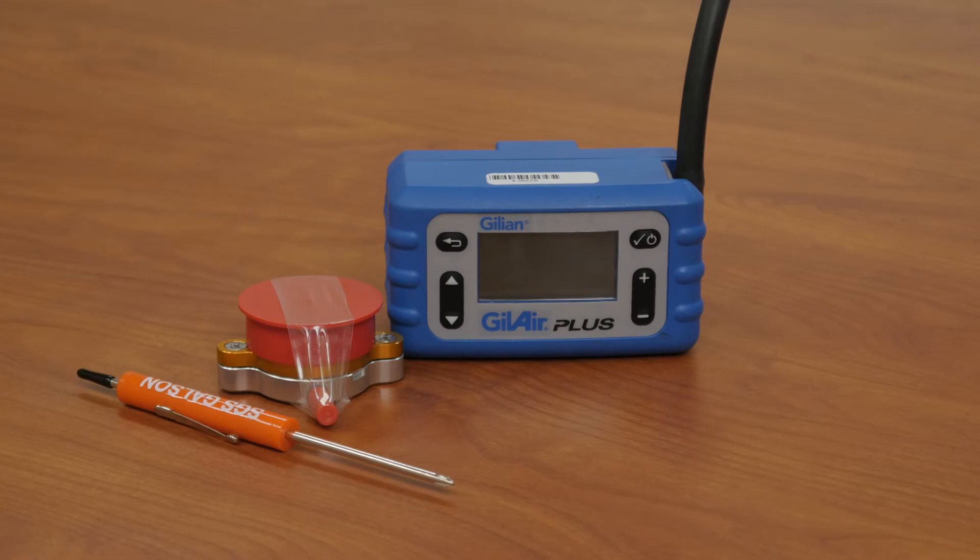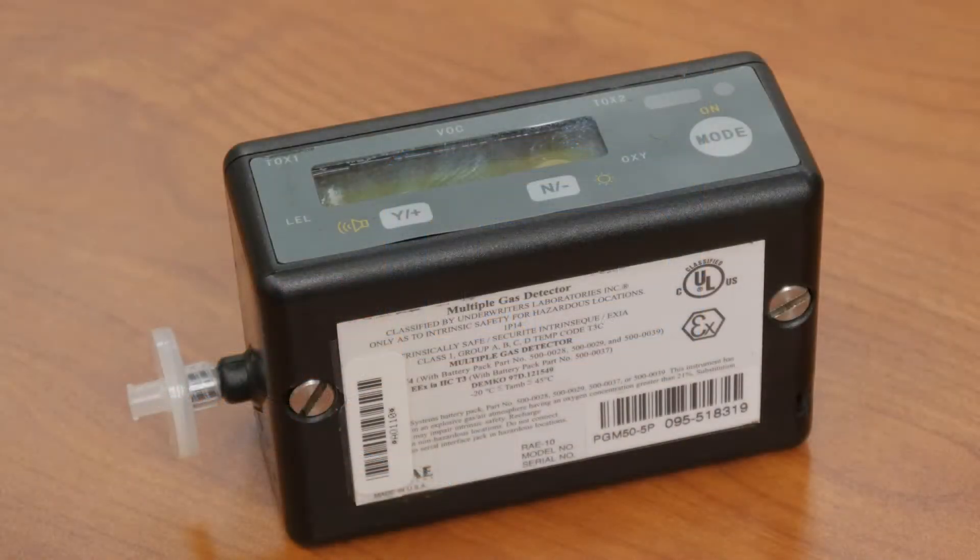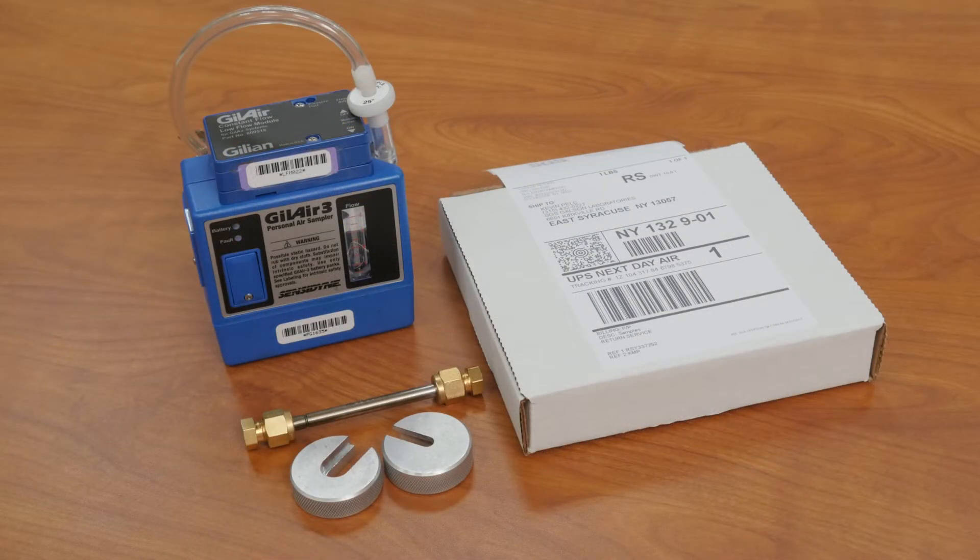The correct quantity of GillAir Plus pumps with PEM samplers, a multi-ray gas monitor or equivalent carbon monoxide monitor, and the correct amount of air sampling pumps for the 10-target compound sampling, along with the correct amount of thermal desorption tubes and a pre-labeled sample return box.